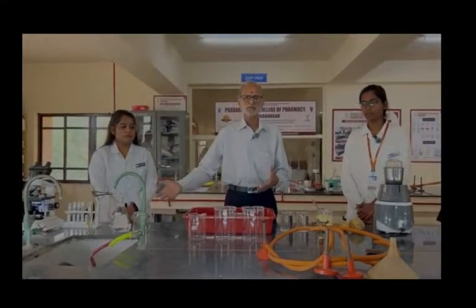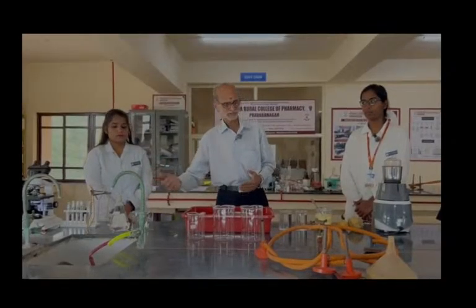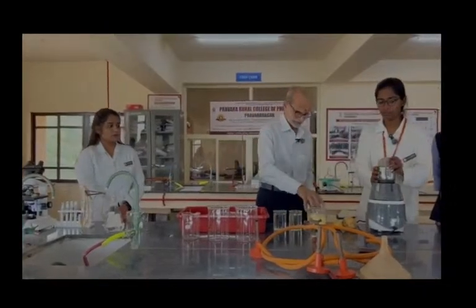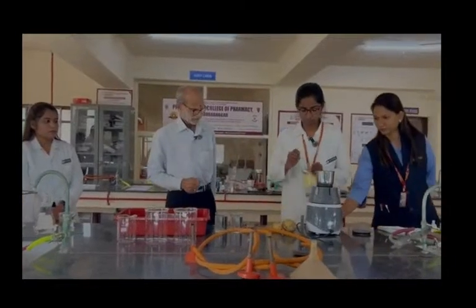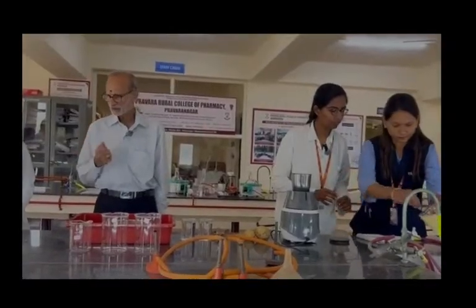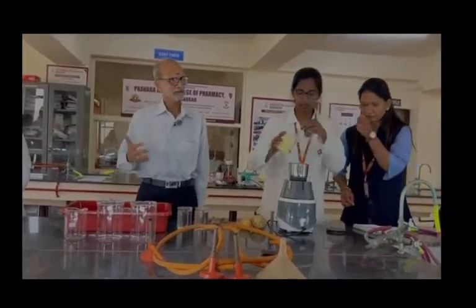Though commercially this particular method is not used, for demonstration purposes we are going to use methanol for the drying purpose, to remove the remaining water from it. So Bhakti, please start with it. We have peeled potato pieces, put them in a mixer. And once we have the starch, we will identify that starch both chemically as well as microscopically.